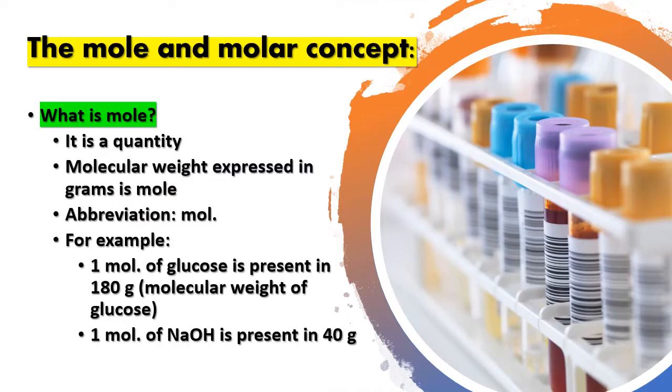Solutions may be made in different formats, like molar solutions, normal, percentage solutions, parts per million, parts per billion, etc. But I will concentrate more on the mole and the molar concept first, and then in the later part I will discuss something about other types of solutions as well. But in most of the molecular and biochemical labs, the mole and molar concept is used, and many students in fact confuse this concept of mole and molar.